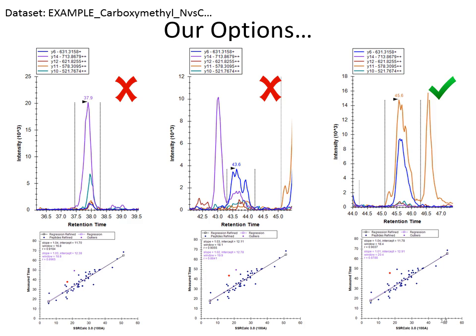All right, well, and then the one at 43.6, this again, you can see that it doesn't have the same apex. They don't all line up, but they're just kind of shifting all over the place. And so maybe, and it's not so close to the retention timeline. So this one, 45.6. Why would I like this one? I mean, it doesn't look that great. I don't know. Would you like it?